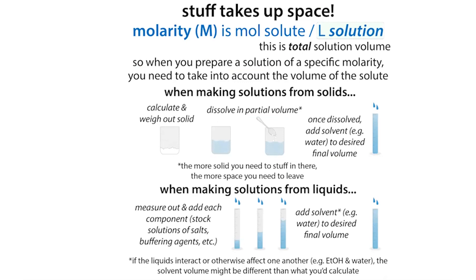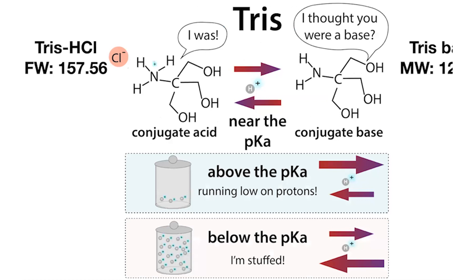Remember that you have to look and make sure you know which form of Tris you're dealing with. Typically I start with the Tris base. You can start with a mixture of the base and the acid if you want something with a lower pH. You can also start with a mixture of both Tris-HCl solid and Tris base solid, but remember that you have to use different formula weights or molecular weights when calculating how much of each to add.